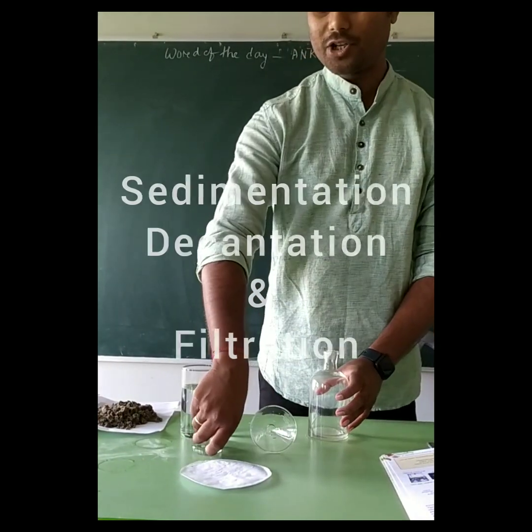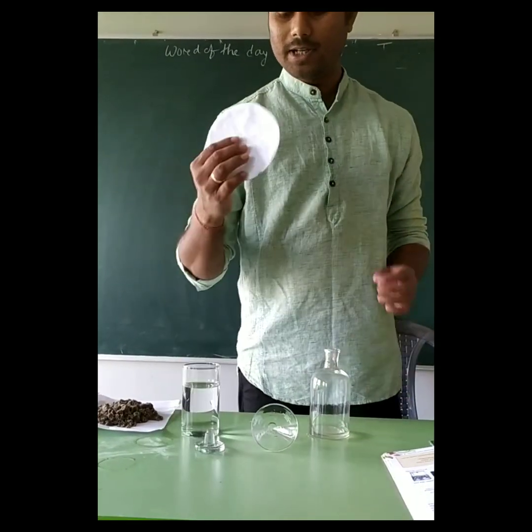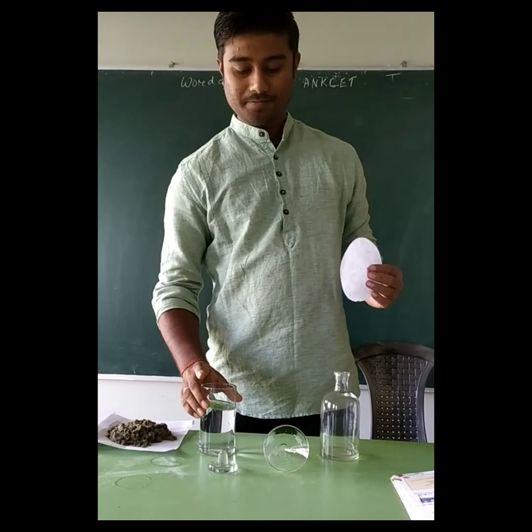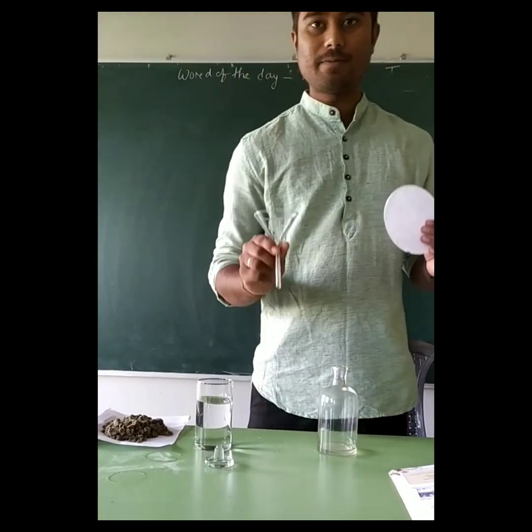We will do filtration. This is filter paper, this is beaker, and this is funnel.